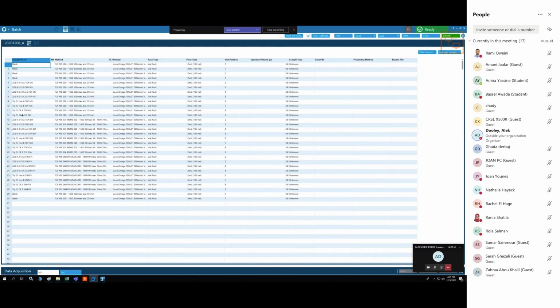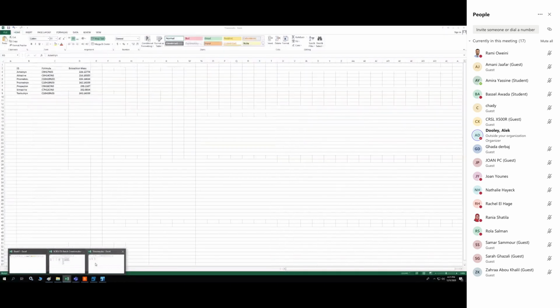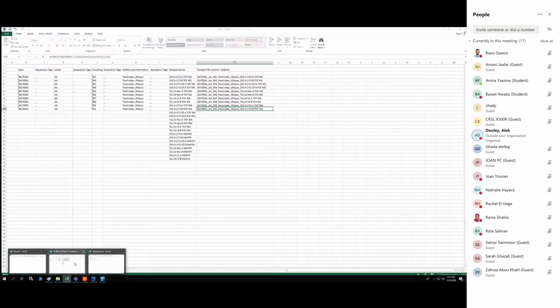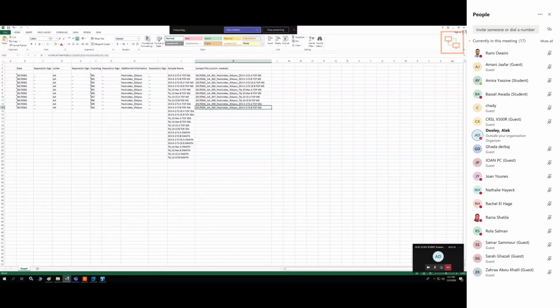So everything in terms of the samples and the method and so on will be fine. All we will do is copy in the data file with today's date. So we'll collect it into new data files. And I will use, we have time, I think. So we can use this, yeah.